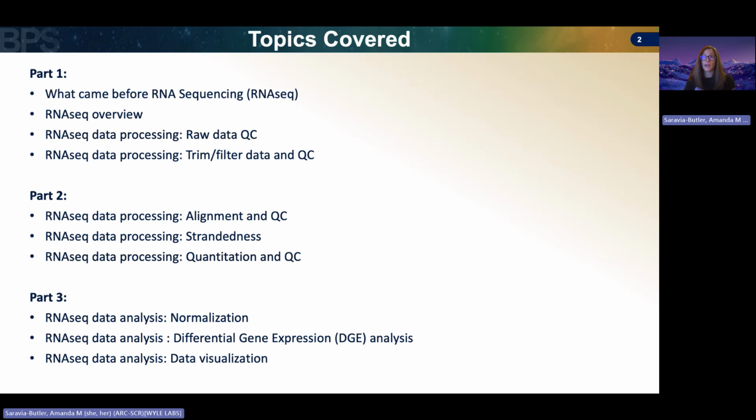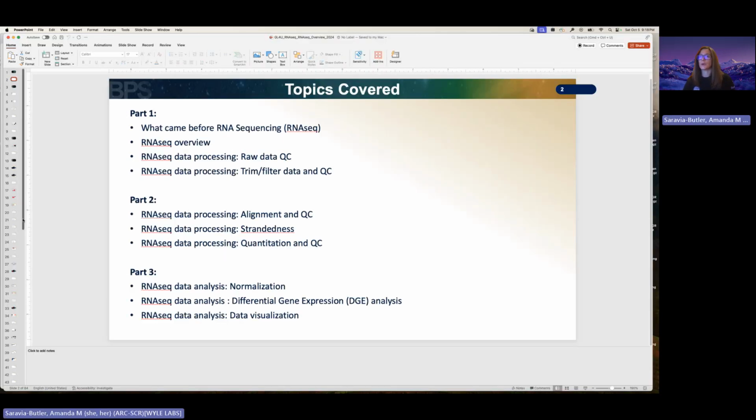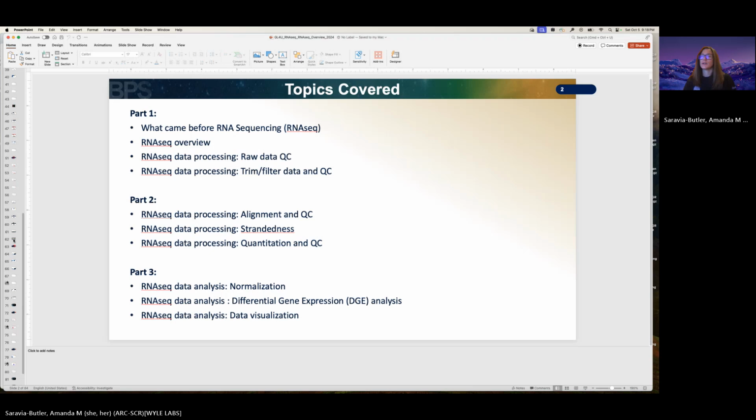If you have not done that, I want you to pause this video and go back and do those things, and then come back and join us for part 3 of this RNA-seq overview lecture. During this part, we are going to be covering our count data normalization, differential gene expression analysis, and data visualization. And so let's go ahead and jump to where we left off at the end of part 2.